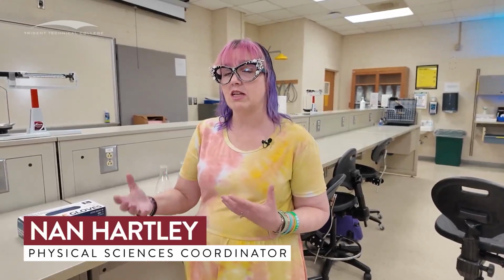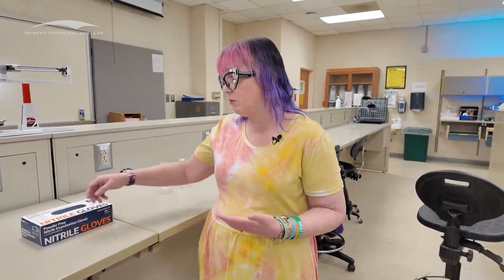They're not necessarily necessary. It's never that we don't want you to wear them, but you don't have to wear them for the other experiments. For these, it's necessary. So I want to show you how to properly put on a pair of gloves, how to take them off, and then talk about proper protocols for using those gloves in those experiments. So let's talk about how we put those gloves on.